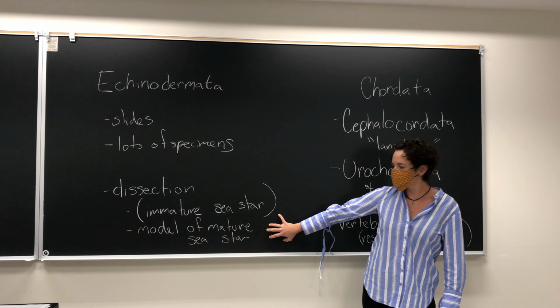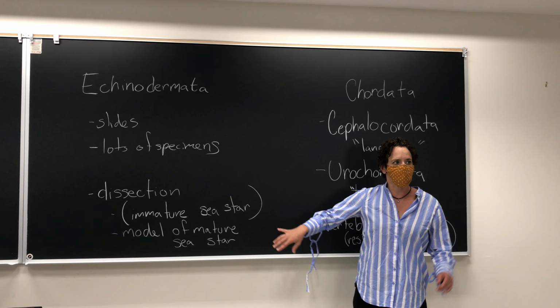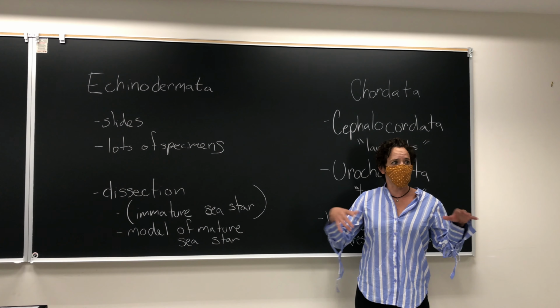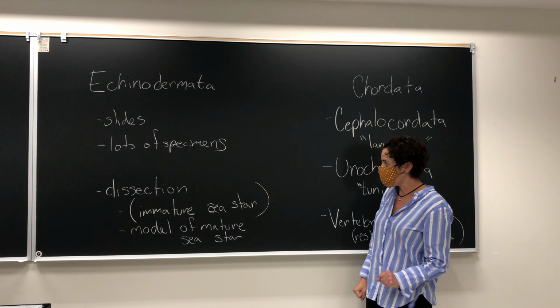So we also have a really nice, huge model of what an adult sea star would look like inside. And I have pictures of that, or if you're in lab, you can actually pull parts of that model apart. But I do have photos of one of these dissections.